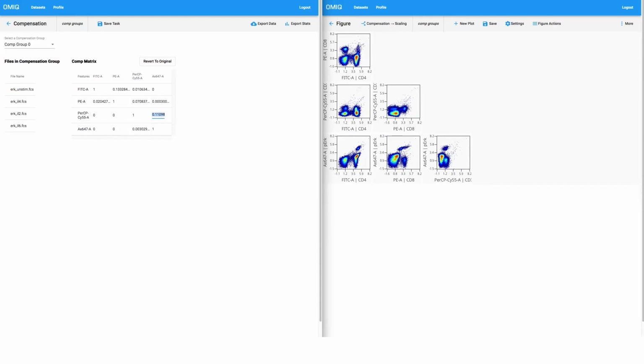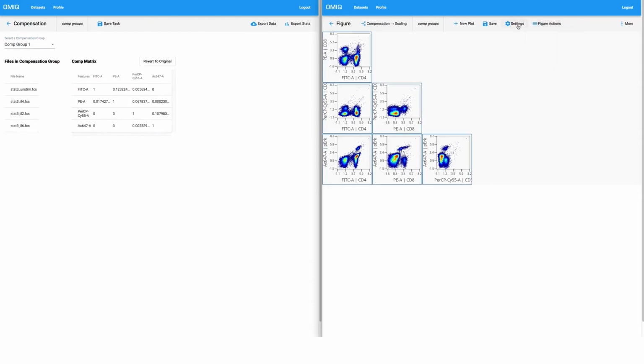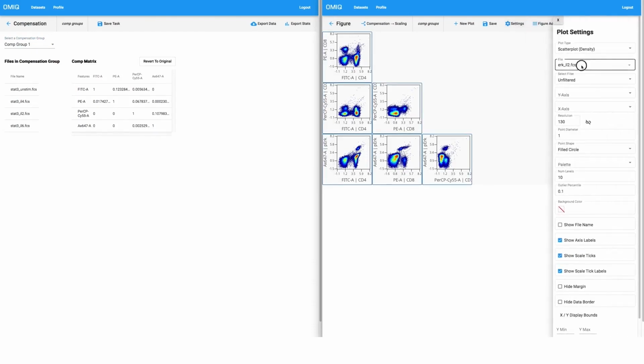And we can optimize how we see fit. We can also change the group that we're looking at. However, depending on what group we're looking at, depending on what information we have present here, we might have to do things like change the file that we're looking at.